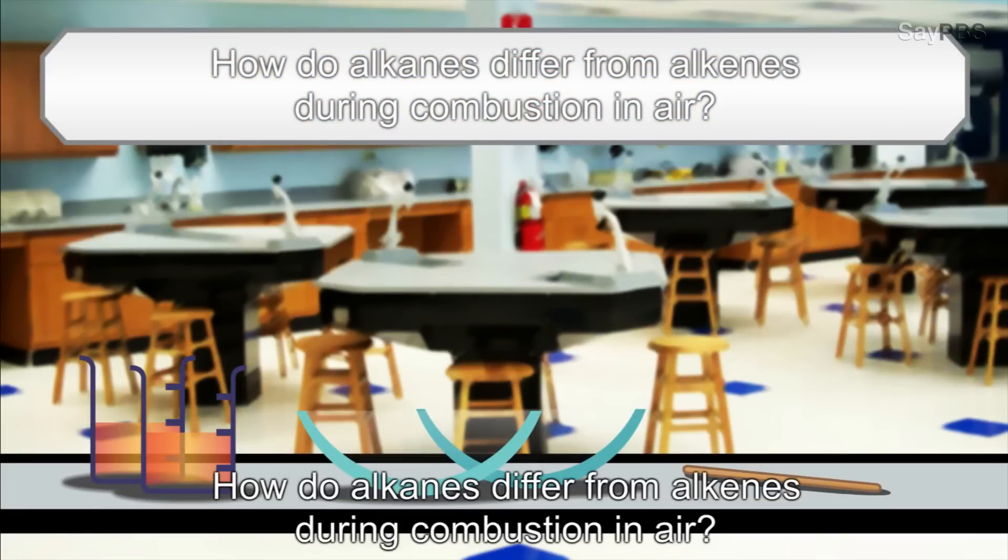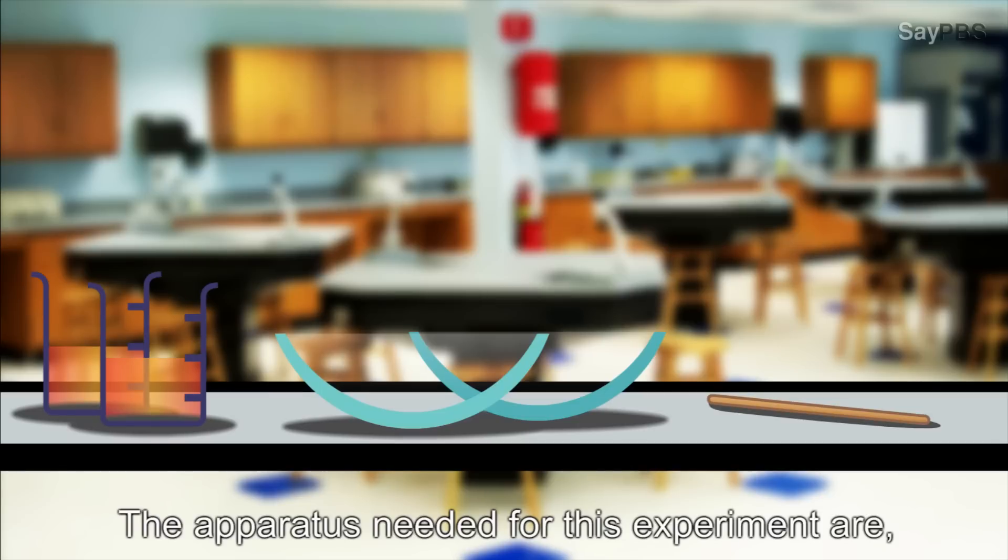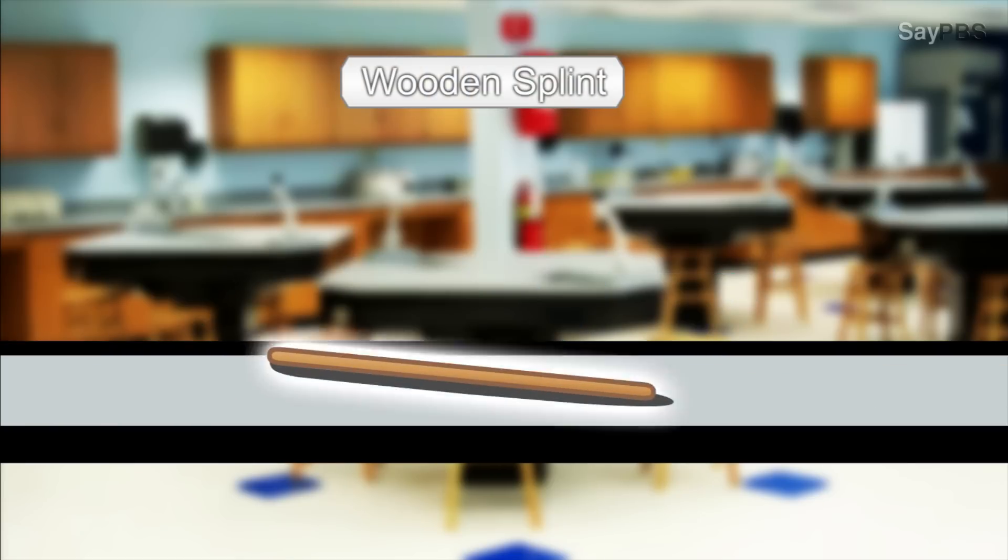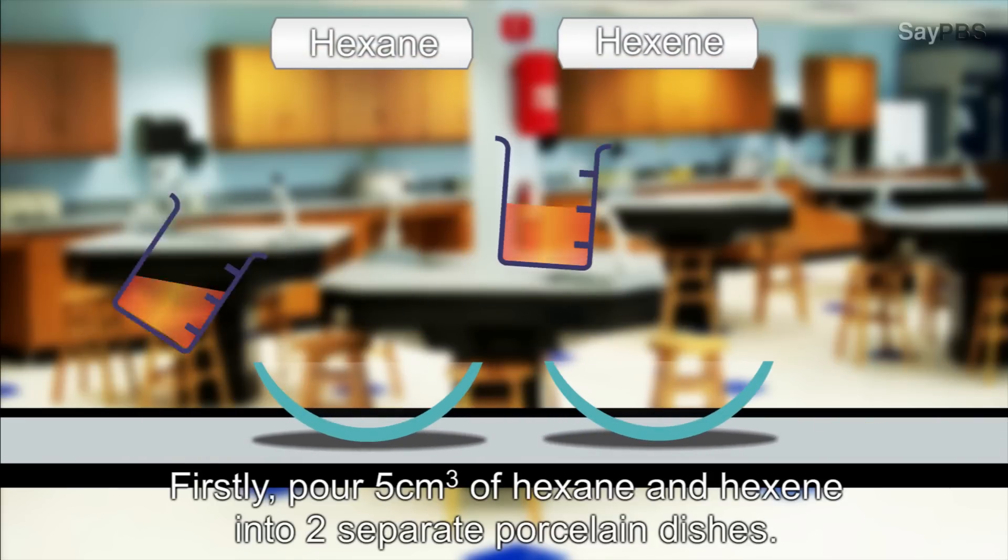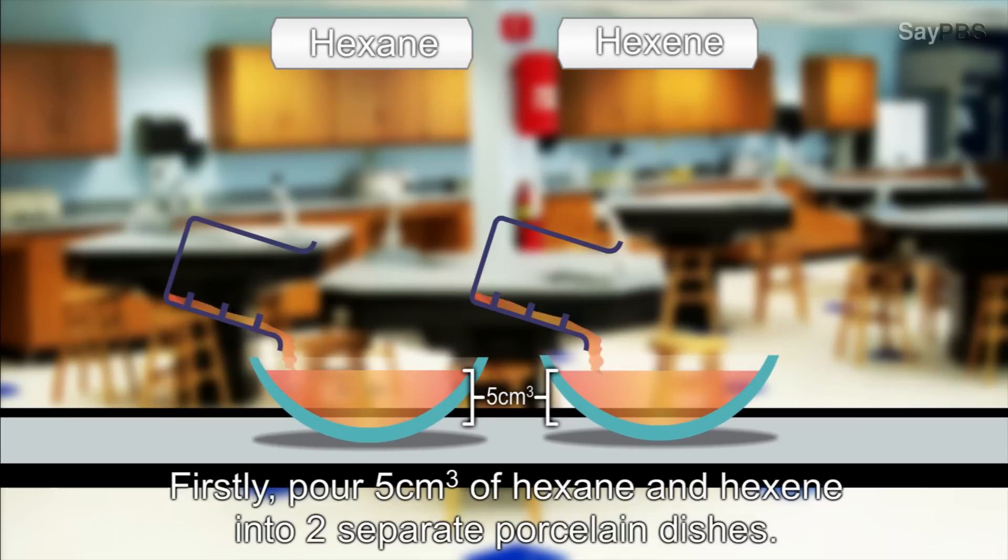How do alkanes differ from alkenes during combustion in air? The apparatus needed for this experiment are porcelain dishes, wooden splint, hexane and hexene. Firstly, pour 5 cubic centimeters of hexane and hexene into 2 separate porcelain dishes.